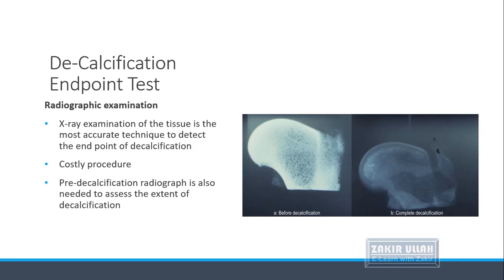But the problem is that it is a very costly procedure, and we also need a pre-decalcification radiograph for assessment of the decalcification process. For example, in the picture on the left we have a radiograph of a bone before decalcification, and on the right a radiograph showing that the bone is almost completely decalcified.